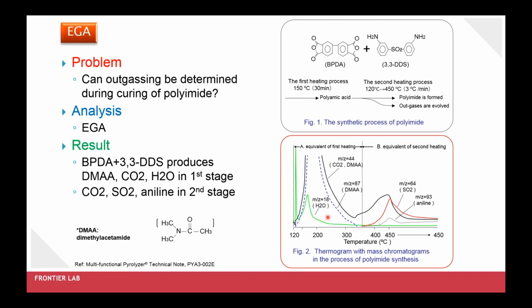So this is just an example. I said it's one of many in which we can look at off-gassing. Other tools that we have are we can add UV light, or we can add air to do oxidative and light-based degradation studies and see off-gassing as well.